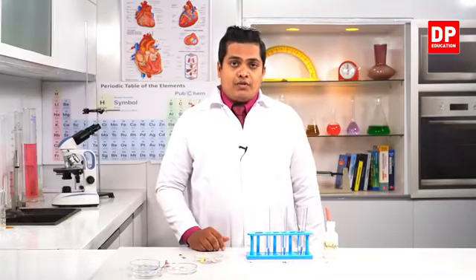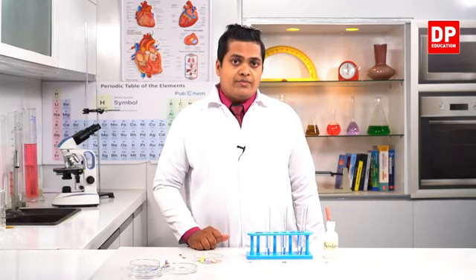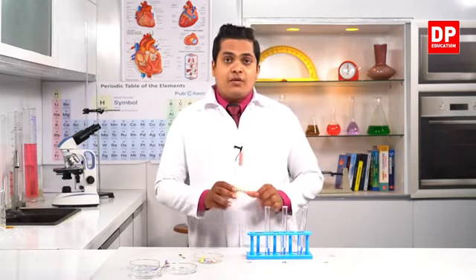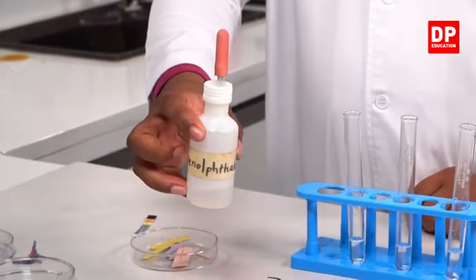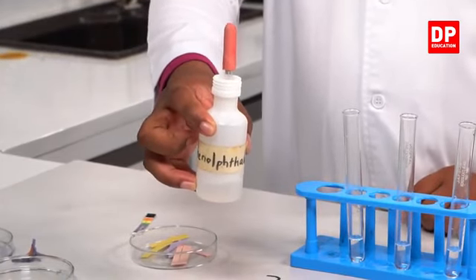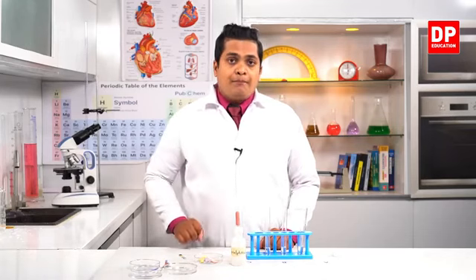Here we are going to observe the color change of these solutions with the presence of phenolphthalein. Here I have phenolphthalein solution. Phenolphthalein is a special indicator that can be used to identify bases. With the presence of a base, phenolphthalein is giving out a pink color.